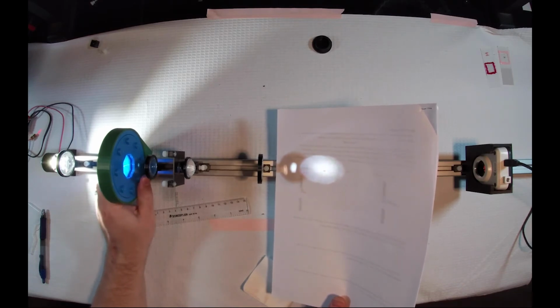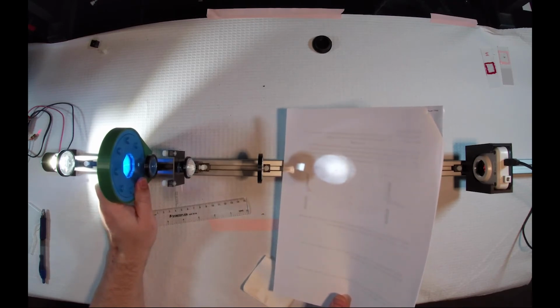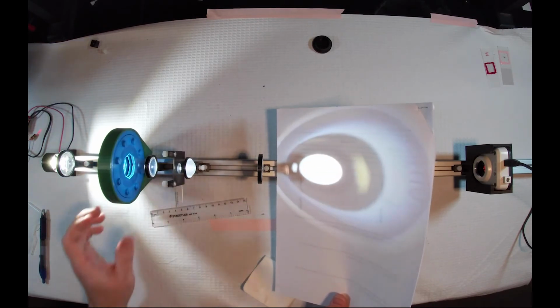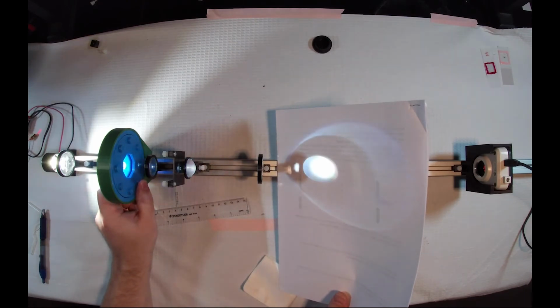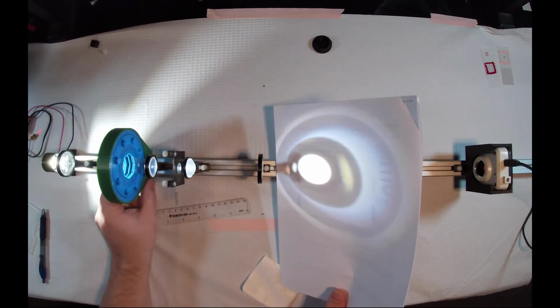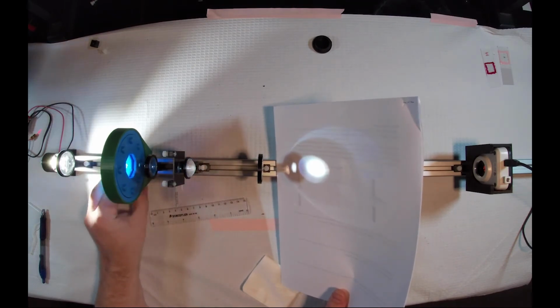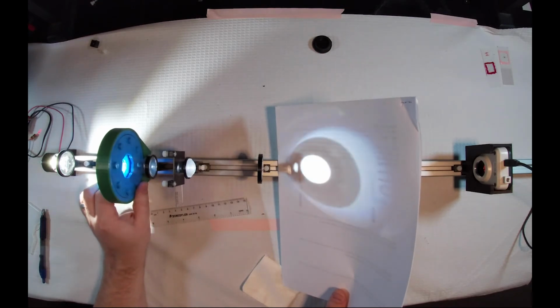Because again, you should know that this is roughly the undiffracted light. We're not letting in all of the high angle illumination rays, only the very low angle illumination rays. So you can begin to see the formation of the LED on it. So let's narrow this down, and we will move this back and forth. It's pretty forgiving.